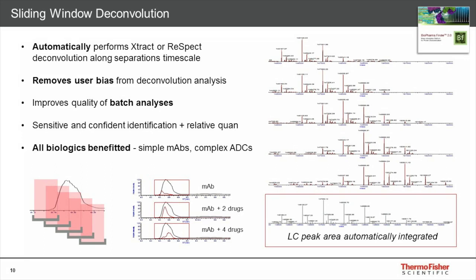So I think we all really just want to put the sample right in there, but the complexity of the sample oftentimes means that we need to separate this out from other forms. And getting that separation, I think we can all appreciate that the data become even better. But once we start separating things, the data are different. So what do I mean by that?